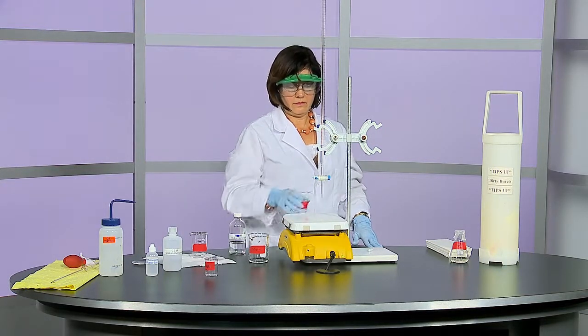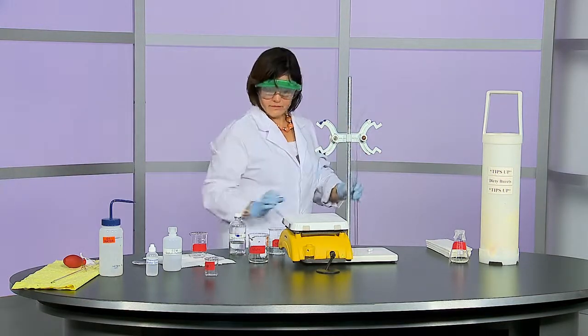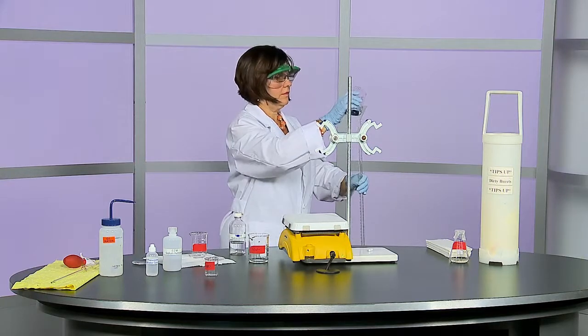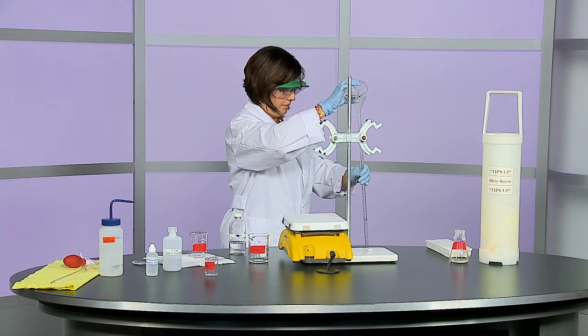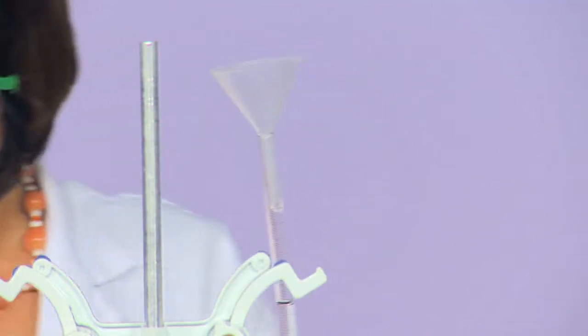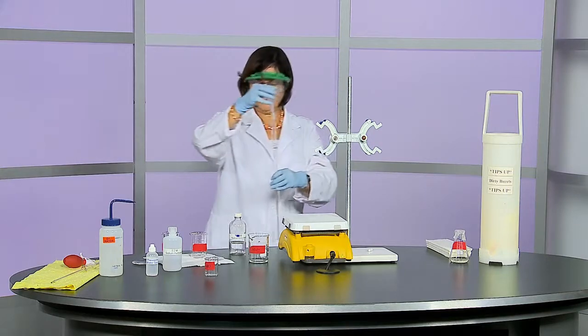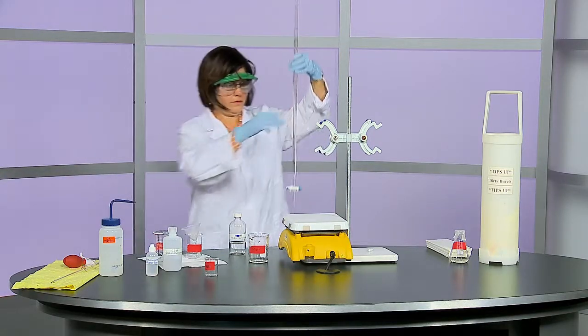Now let's fill the burette. Adjust the height to make sure you do not have to stretch when pouring. Add sodium hydroxide until it is close to the 0 milliliter mark. Remove the funnel and wait a few seconds to allow drops on the wall to roll down. Adjust the volume if necessary.